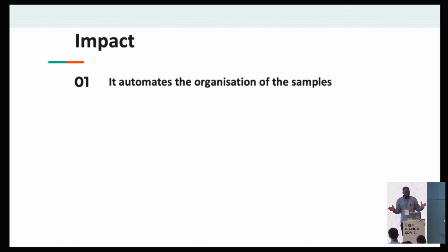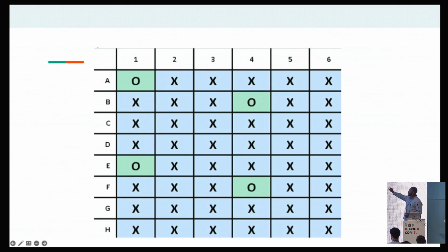So once we receive them, we pick the scanner. Once you scan, it will tell you where to put the sample. Let me just share the holding rack. So once you scan the sample, it will tell you, put this patient sample in F04. It gives you the location, and it also checks that the two samples from the same patient are not beside each other. So that's one of the advantages of building a laboratory process management system for us.